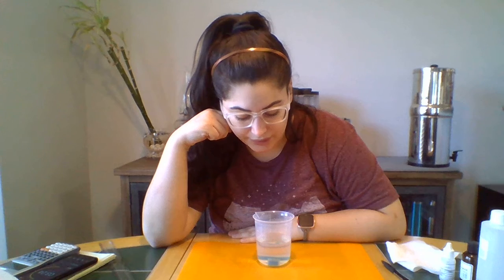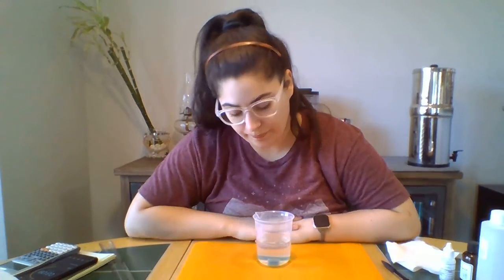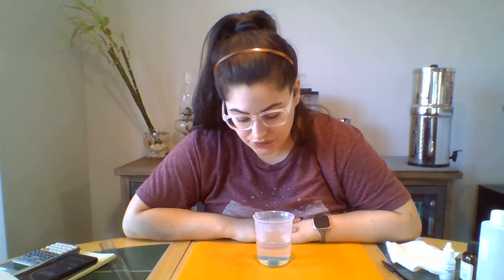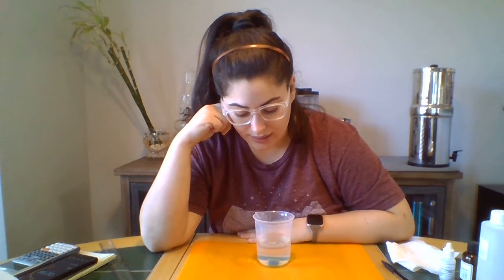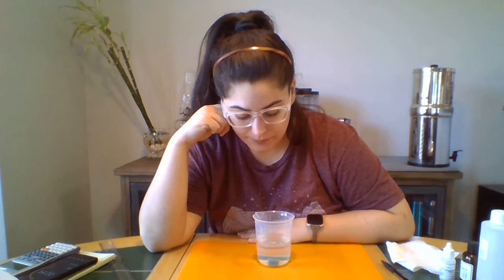I wonder if any are going to completely change. I wouldn't expect the 2 centimeter by 2 centimeter by 1 centimeter to completely change, just because I figure it would take longer for the solution to soak up into it. If any of them change completely, I think it's going to be the little cube.